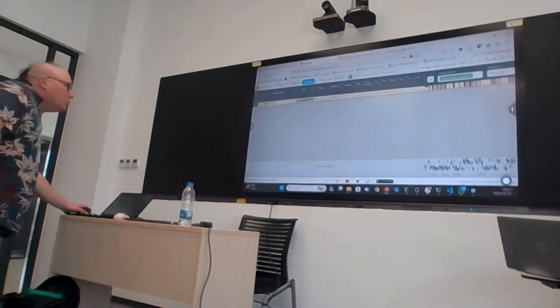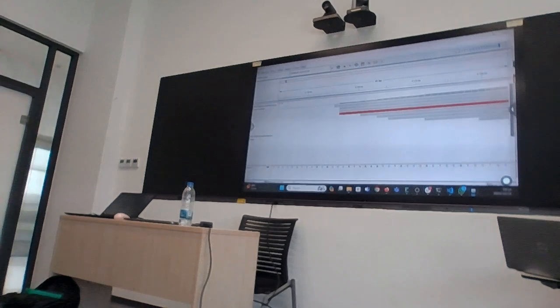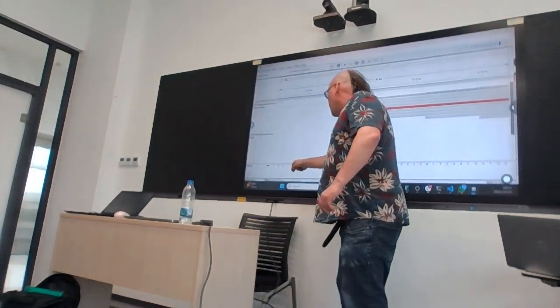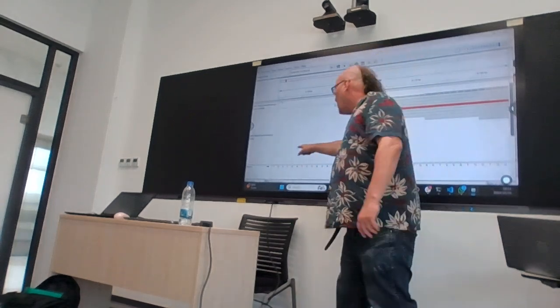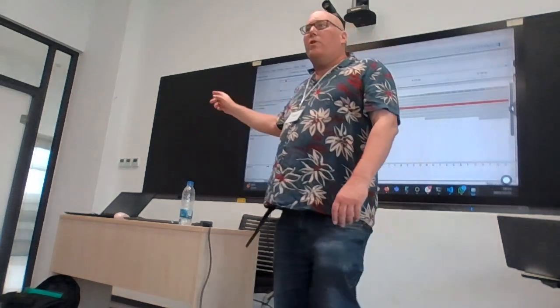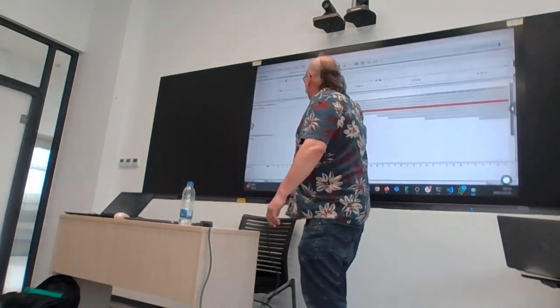Let me turn that into a question. Have a look at the screen, please. The reference of the genome says here TCA whatever, but there are very few reads. What should we say in our genome that we make out of this sample? Which letter should we put in this position?